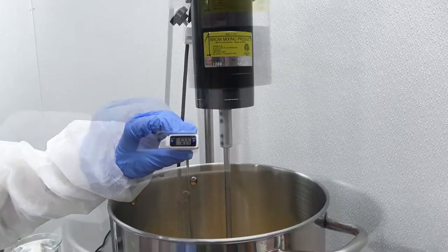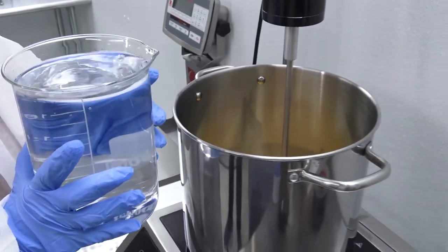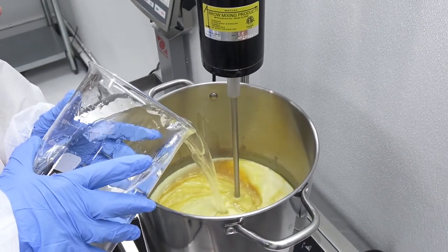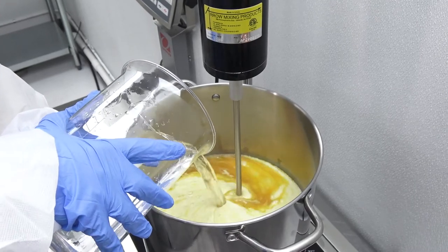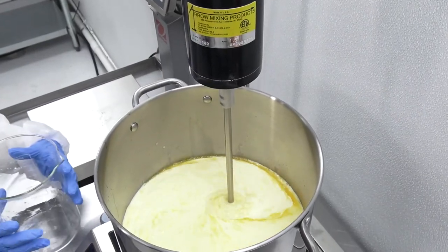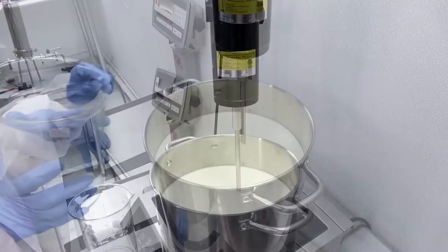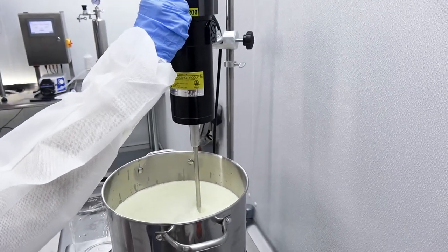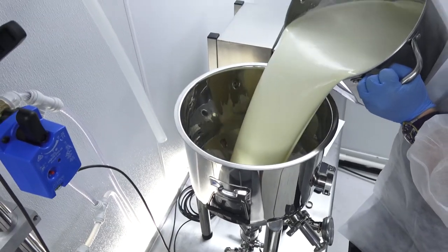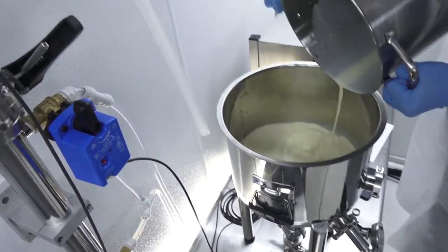Once the batch temperature reaches 65 degrees Celsius, we're ready to add some water. We start with 4 liters of water heated to 60 degrees Celsius, then top up with some room temperature water to achieve approximately 10 liters of total volume. Mix vigorously. Now we transfer the batch to the process tank and add additional water to achieve the correct final batch volume — 8 more liters in this case.